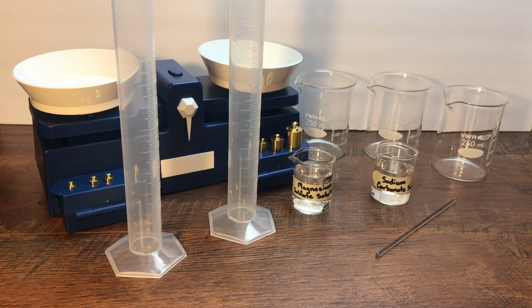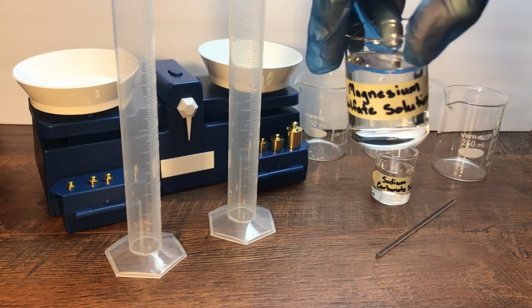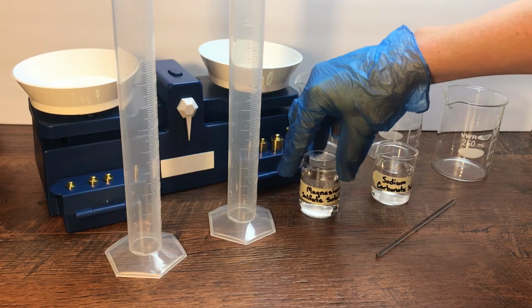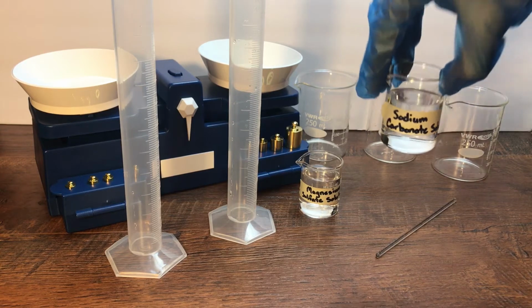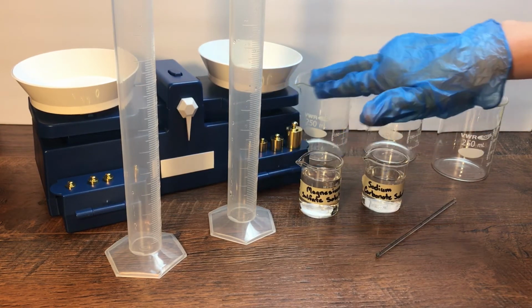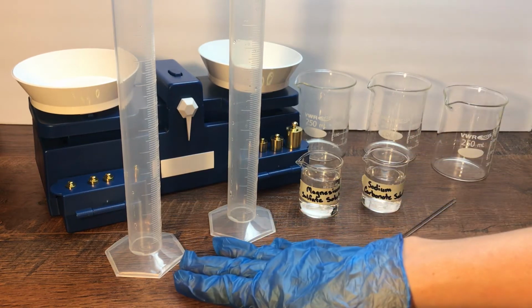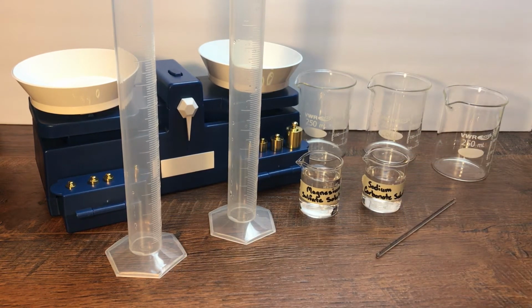For this lab, we're going to need magnesium sulfate solution, which we have in this beaker here. We're going to need sodium carbonate solution, which we have here. We're going to need a balance, a couple of beakers, 2 graduated cylinders, and a stirring rod. Now this lab is open to your creativity, and there's not a correct way to do it. Our goal is to determine what happens to the mass of the system during a chemical change.